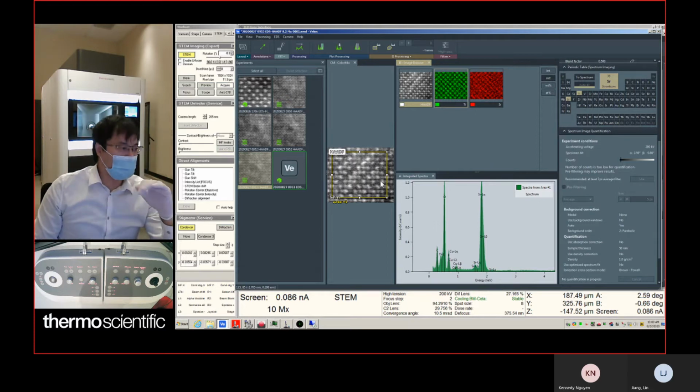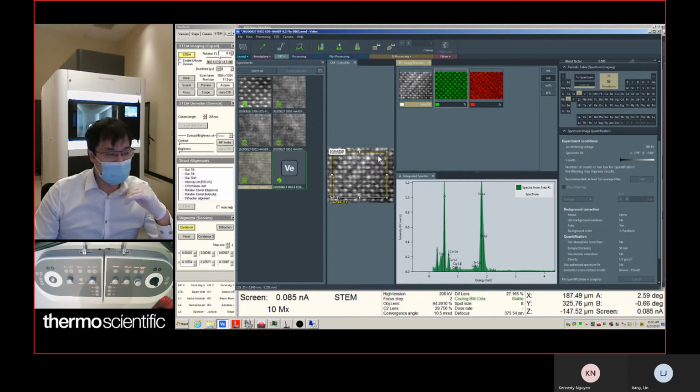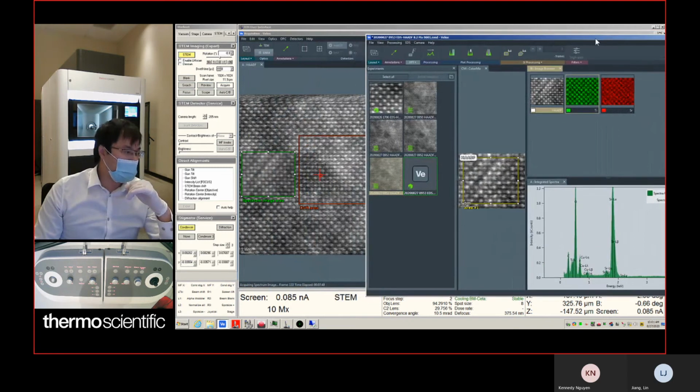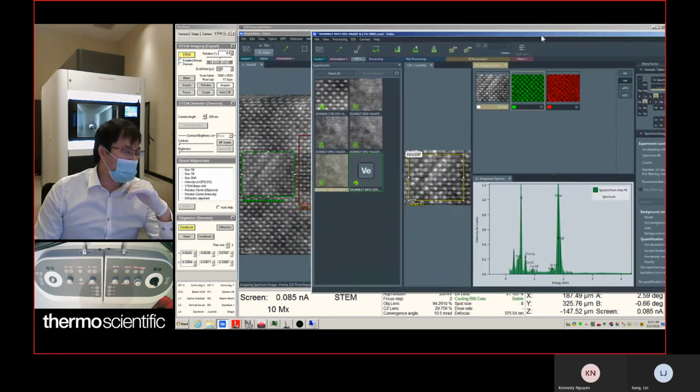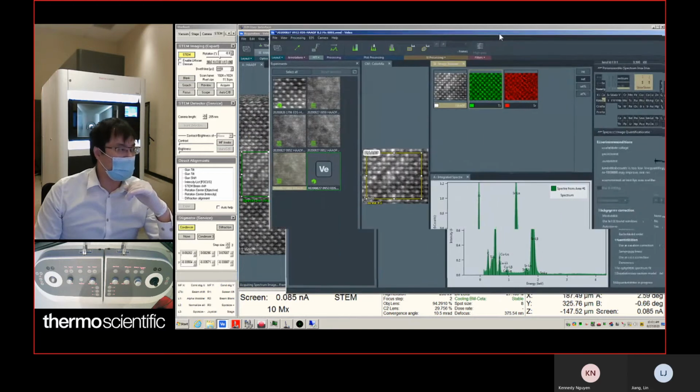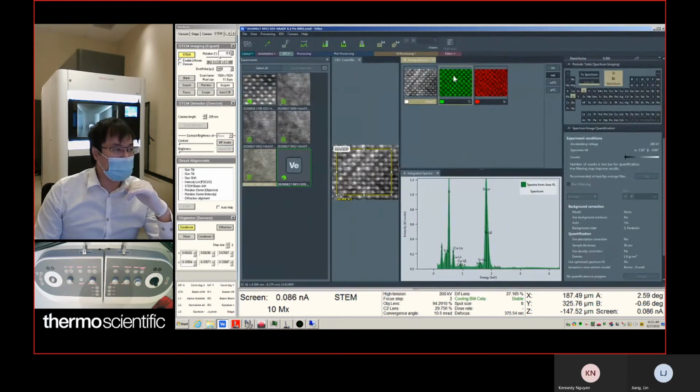To bring it back, if you go autofocus during the scan, you can also adjust a little bit of focus to bring it back. So right now, you can check how many frames we have. We have 130 frames almost. So we're starting to see the titanium atom.